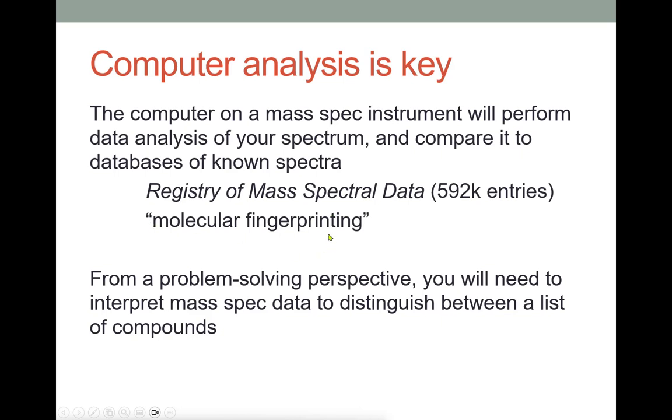So basically, all of those little tiny peaks that you and I can't necessarily make sense of, those will be common. If the same molecule undergoes the same fragmentation, it'll give the same fragmentation pattern. And so we can find those, we can match those computationally and get a really high degree of confidence in our identification, our analysis.